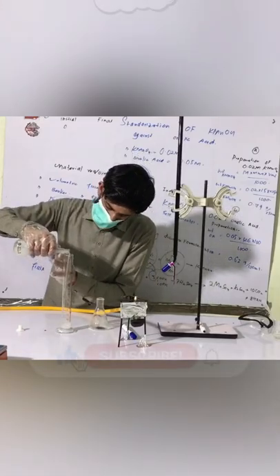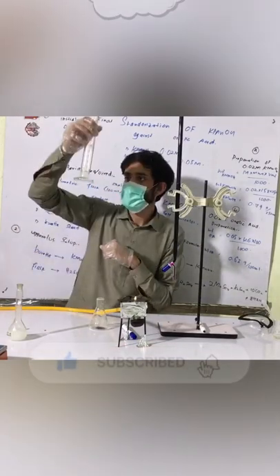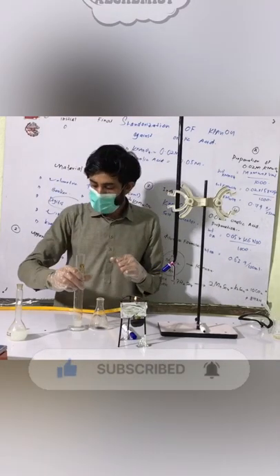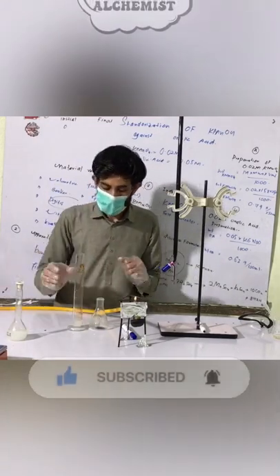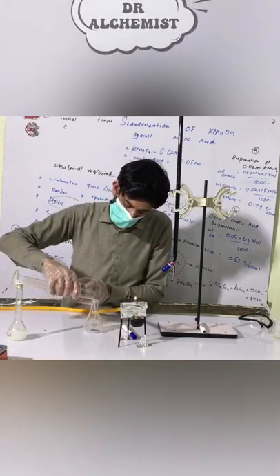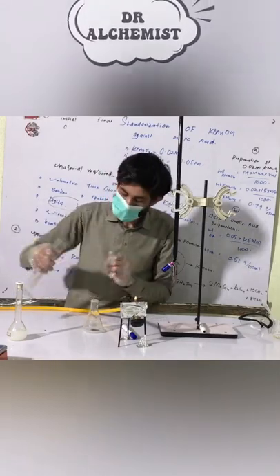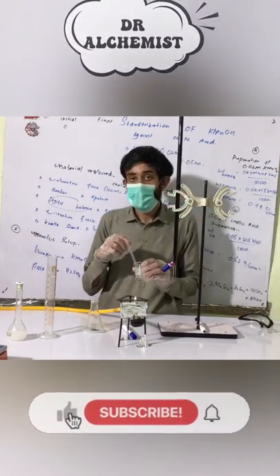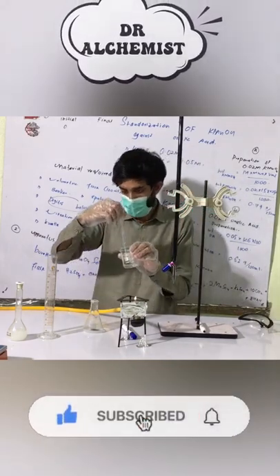Hi everyone, this is a short experiment for redox titration. You have to take oxalic acid in the titration flask. You can see I'm adding oxalic acid to the titration flask. After this, you have to add concentrated sulfuric acid to the titration flask.